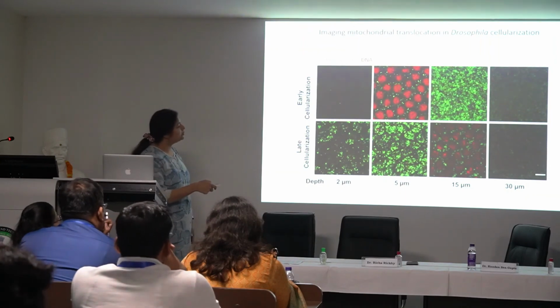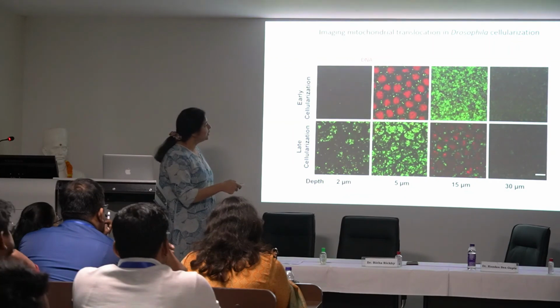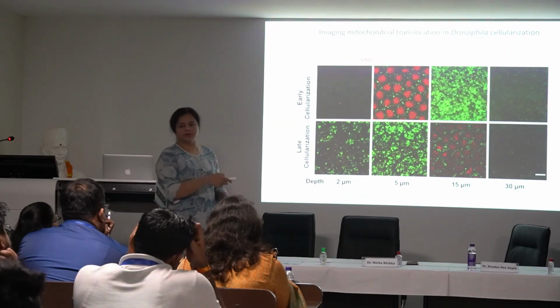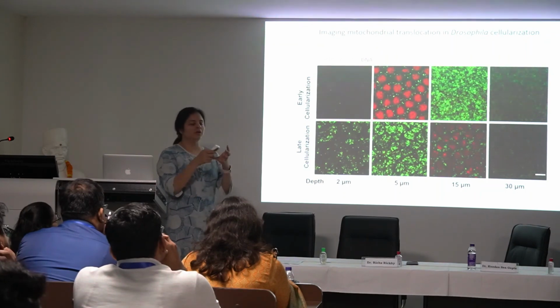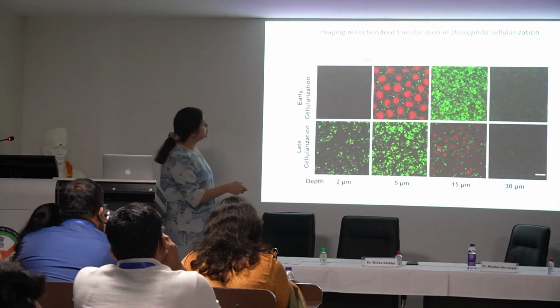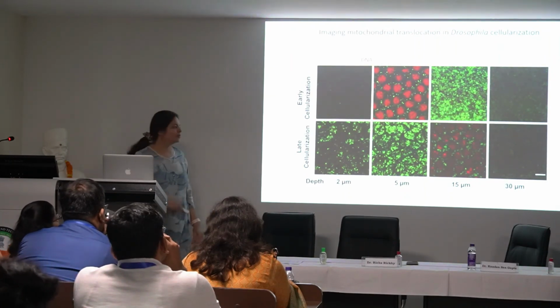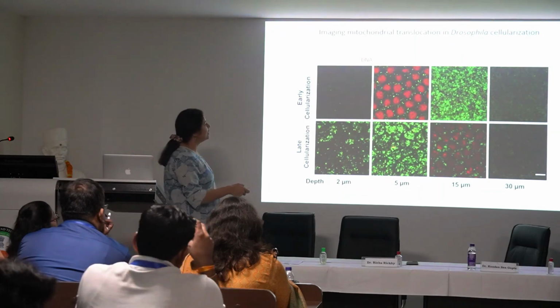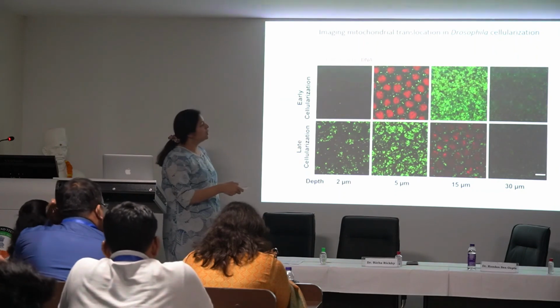So in fact, they form this very interesting cloud of mitochondria. And one of the nice things is we are now imaging all kinds of organelles at this point. So this is a very interesting mitochondrial cloud which is present around the ER. So is this a mitochondria-ER interaction? It may be. So it's very attractive to think of that question in this particular context. So one is the motor control.